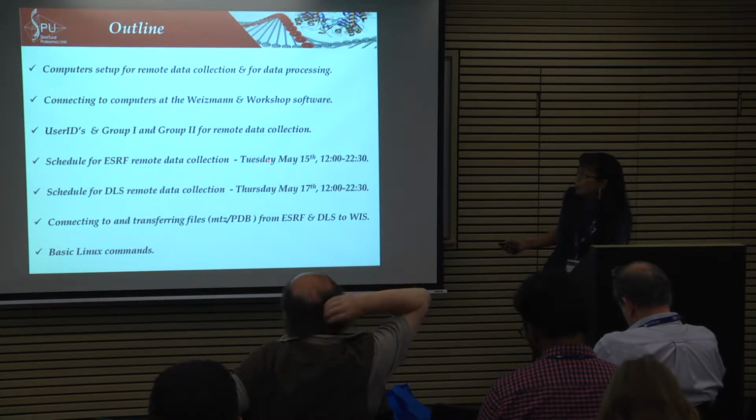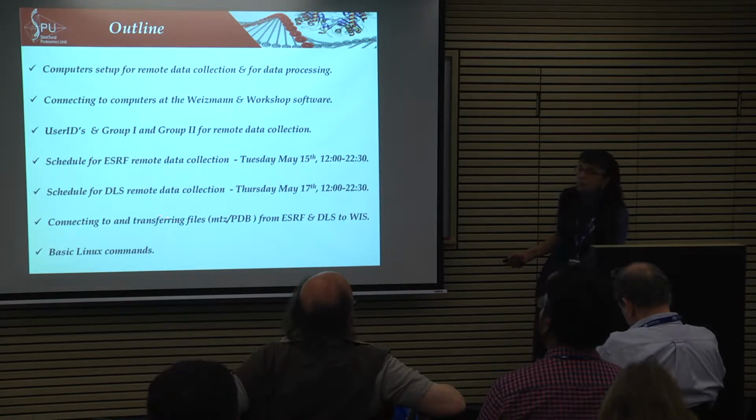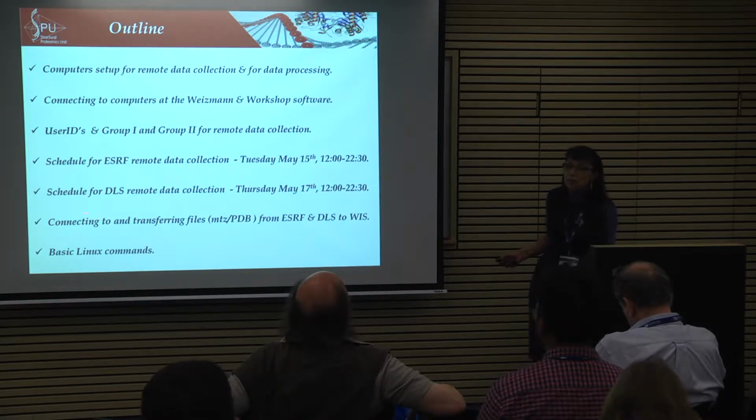The ESRF is on Tuesday, on Thursday is the DLS, and how we can connect and transfer files, MTZ and PDB only. Like we said, we don't want you to retrieve all the actual frames from your data collection, because otherwise we're going to be kicked out of the Weizmann Institute. So we want you to come back here, so we won't do it this time. And then some Linux commands.